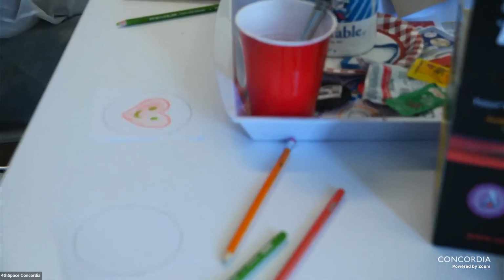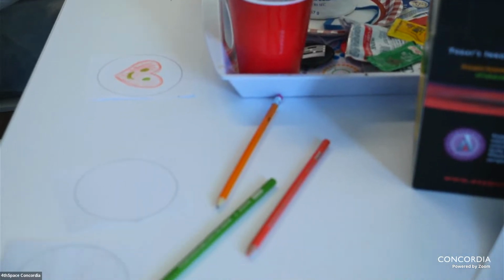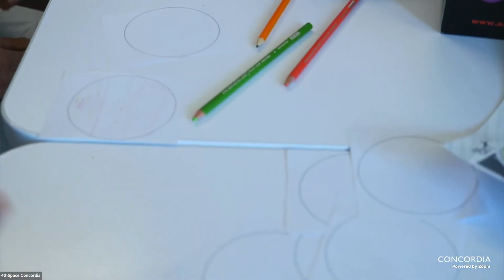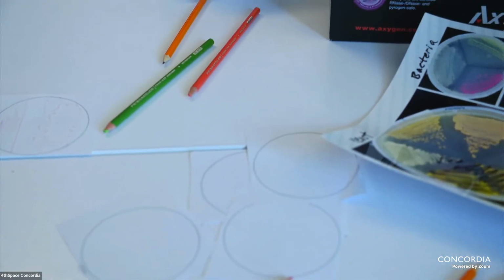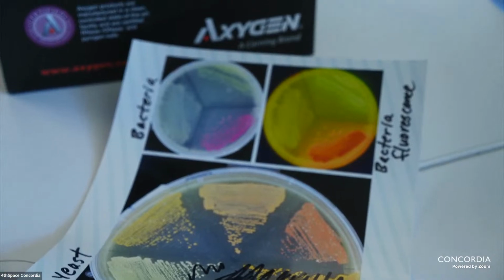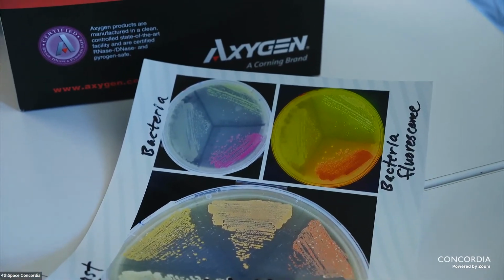Okay, nice, with the loops and the sticks. Perfect. I don't know how to streak without grazing the agar yet. Oh yeah, that's the tricky part. I'll show you guys in the lab. You don't want to press too hard into it, otherwise it can cut the agar. With the cotton swabs, it's actually a bit easier because you would have to press really hard. But with the toothpicks, it's easy to cut the agar up. So are we ready? Okay.